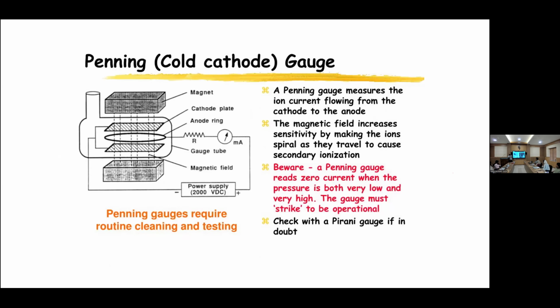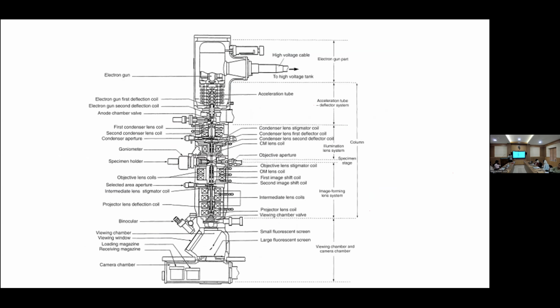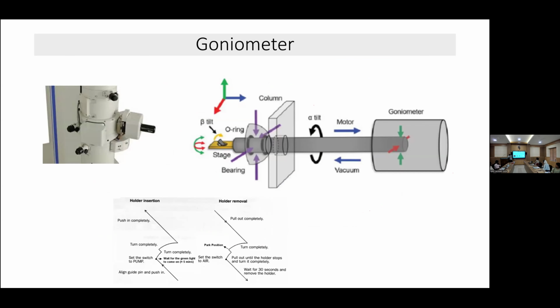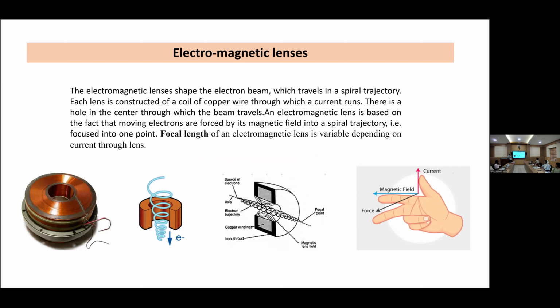So next is this electromagnetic lens. Here you can see the same lens, and then deflection coils to move the beam in the XY direction. This is how our lens looks. Okay. So this is the electromagnetic lens. Nothing, it's just a coil. So how can we control or adjust the magnification as well as the focal length? How is it possible? Current. Yeah, by varying the current.